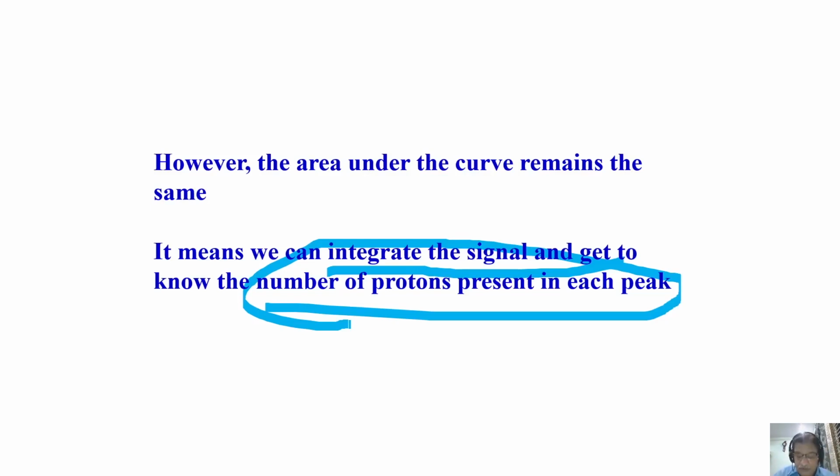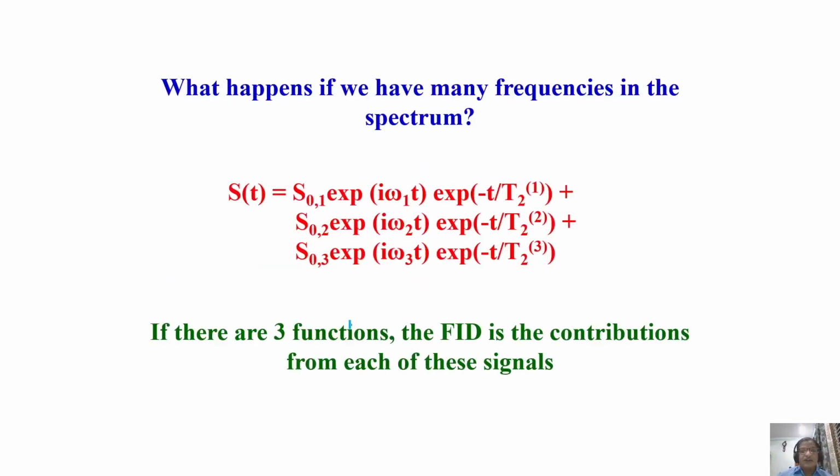It will not change. And still you can find out the number of protons present in each of these peaks. Let us now start questioning a bit more. So far I took only one signal, one decaying frequency, to understand the different components of this.